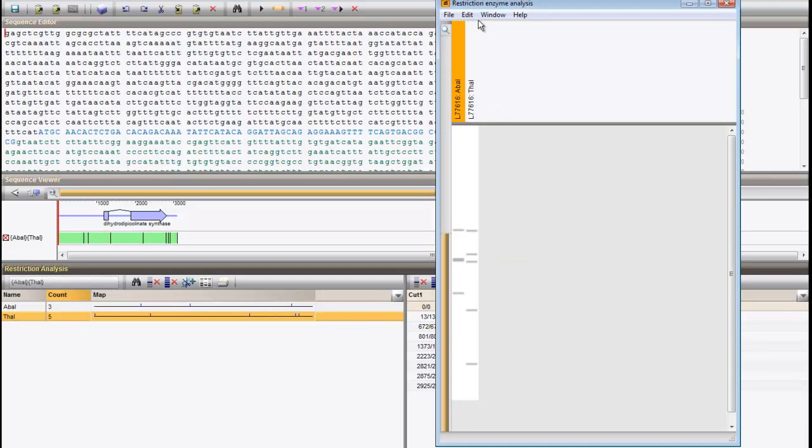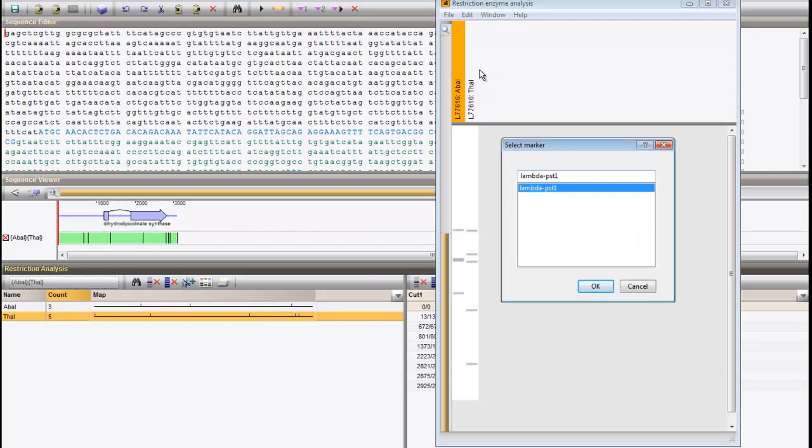Select Edit, Add marker to display a molecular weight marker pattern on the gel.